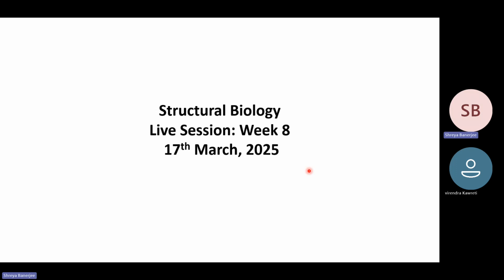Okay, so this is the 8th live session of this course Structural Biology. In this, I'll be going through the lectures of week 8, which will basically be covering different aspects of microscopy, starting from the very basic light microscope going up to cryo-electron microscopy basics. And then, as always, I'll be solving some practice problems on the topic.